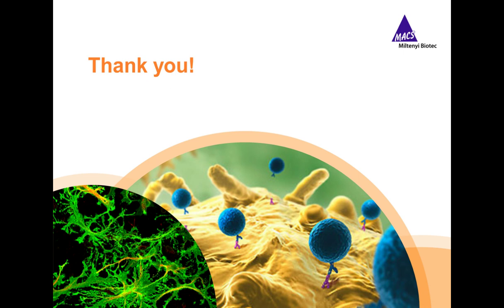From one cerebellum, we can isolate around 100,000 living astrocytes. The same is true for the isolation of astrocytes from 2 hippocampi of an adult mouse brain. We also obtain around 100,000 living astrocytes from the hippocampi of one adult mouse brain. And the viability rates are usually between 70 and 90%.